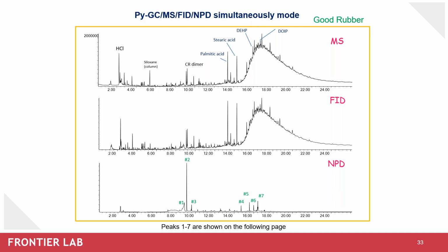But as we saw earlier, the sample chromatogram includes a large hydrocarbon hump at about 16 to 20 minutes. It's very challenging to see minor additive peaks under this hump, even with the MSD. However, the selective NPD detector observes several nitrogen and phosphorus compounds in that region since the NPD does not detect the hydrocarbon. This also allows some additional possible characterization for the sample.